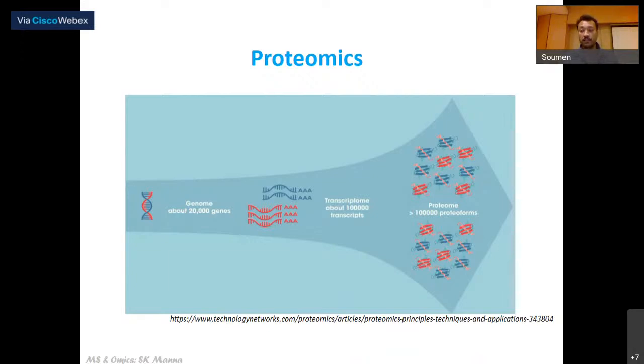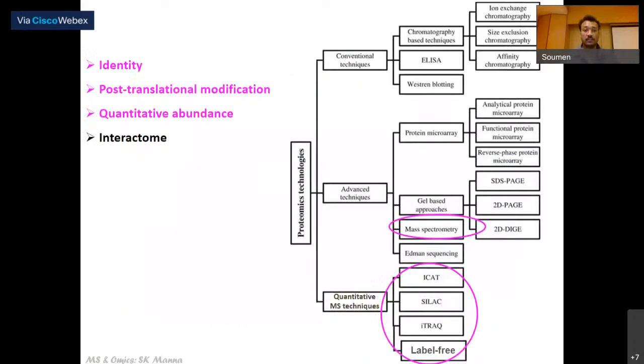We have talked about the structural aspect before, and now we'll be talking about the chemical composition and structure of proteins and peptides. So how to go about that? Typically, the old-school methods for looking into these molecules have been chromatography techniques, ELISA, Western blotting and the like. And still, a lot of experiments are based on Western blots.